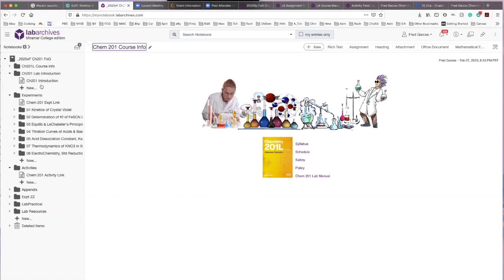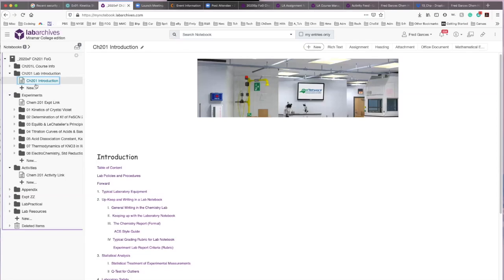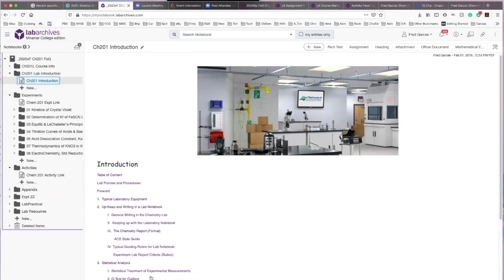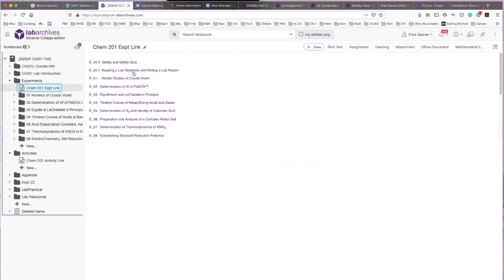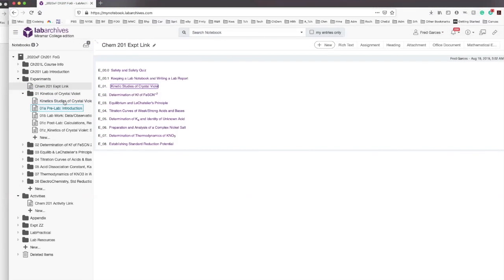A lab introduction, you click on that, it gives you the pages that, again, are on my website. This is just the introduction part and the safety part, etc. And then the experiment starts here. If we go to the experiment link, this takes you to my website for each of the experiments.